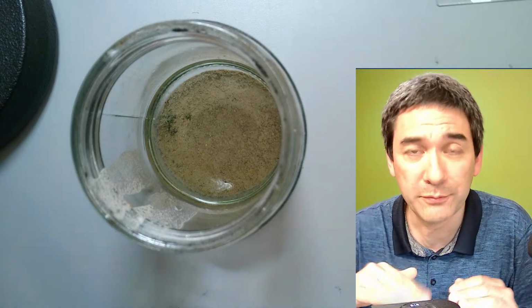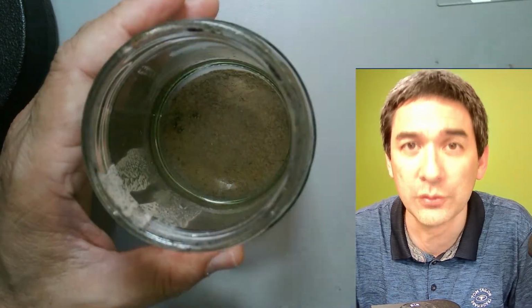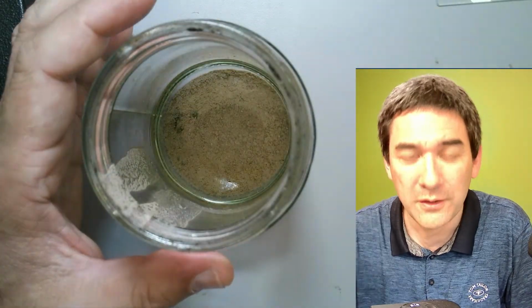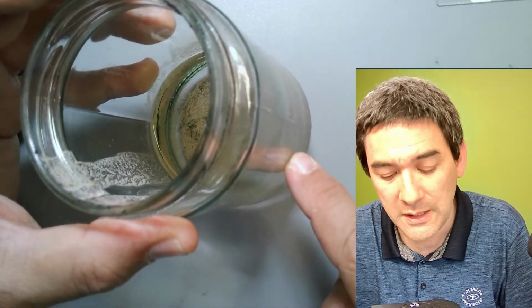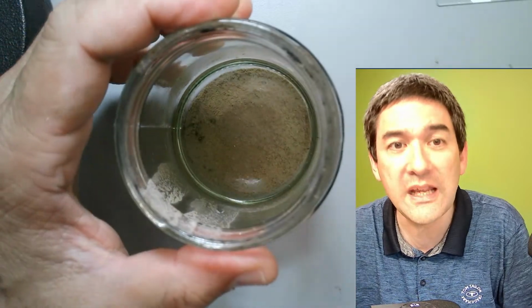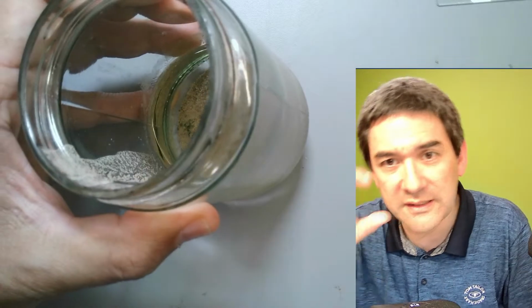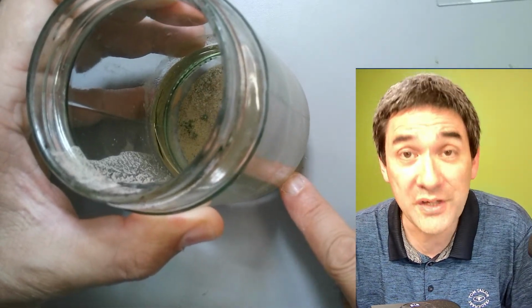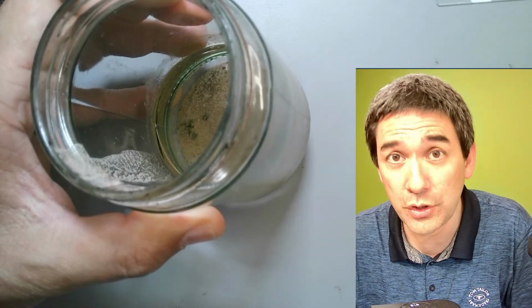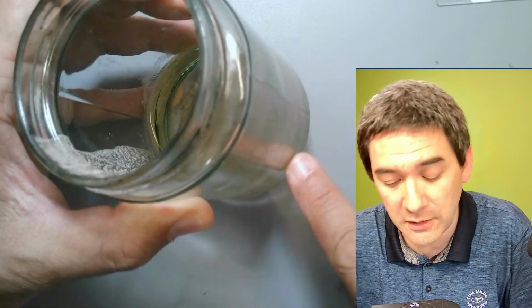But if you want to prevent evaporation, then you add a lid. Now the question is, if you add a lid, is it not going to become anaerobic? And the answer is no. The reason is that there is luckily still enough air in the jar. As long as you've got air, and if you occasionally aerate it, it's not a problem. The bottom part of the jar, or the bottom layers if the sand layer is thicker, will become anaerobic. This also happens naturally on the beach, and that's why there are different microorganisms in the anaerobic part than in the top layer of the sand.